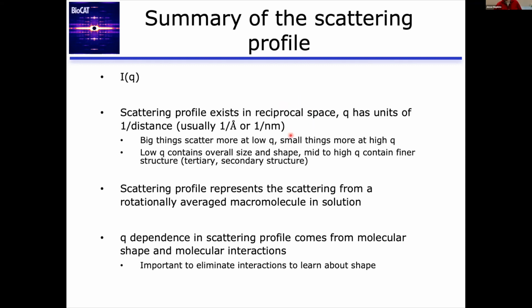In SAXS, I find that typically there's enough of a concentration gradient across the peak that you can see if you're seeing any intermolecular interactions, and you typically only need to run it at 1 concentration unless there's something particular you're looking for.